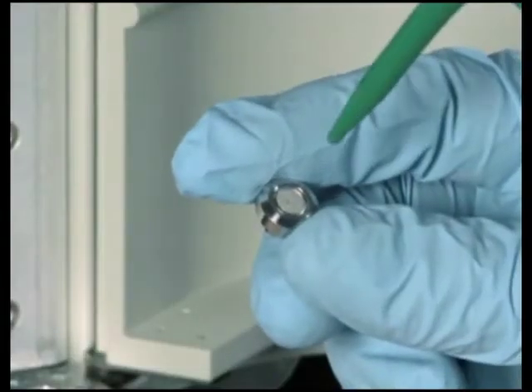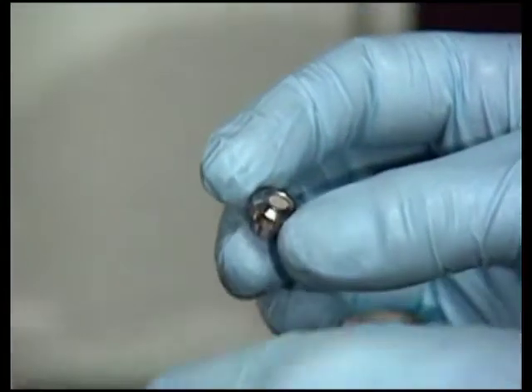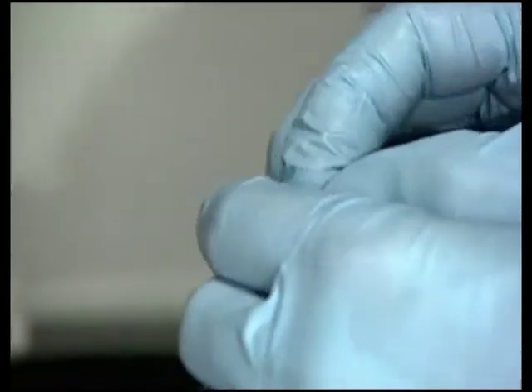Wet the replacement inline filter element with alcohol. Hold the porous side of the new filter up and insert the filter into the outlet side of the housing.